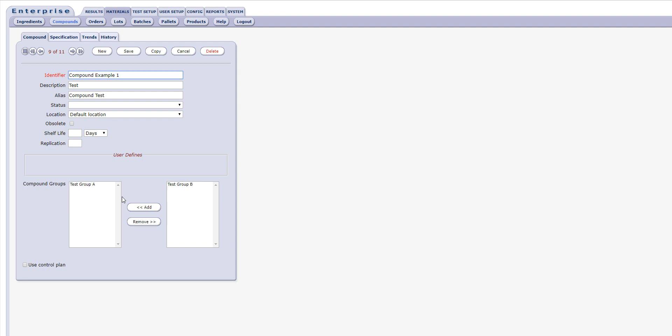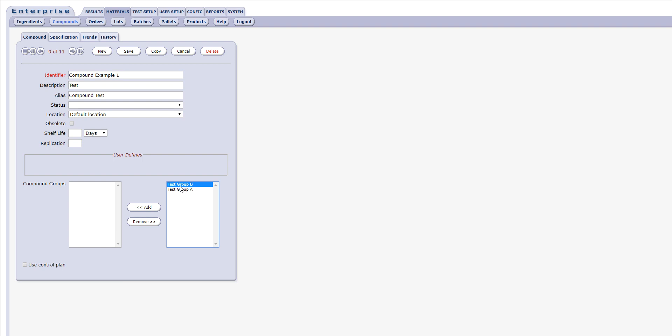Also, you may use control-click to multi-select items in either of the compound group boxes and add or remove several items at once.